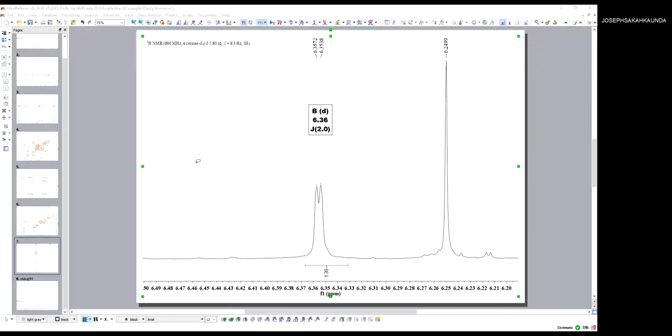From my own experience, whenever you realize that the spectrum is revealing to you the presence of sugar units in a molecule, draw them first, because sugar is very easy.